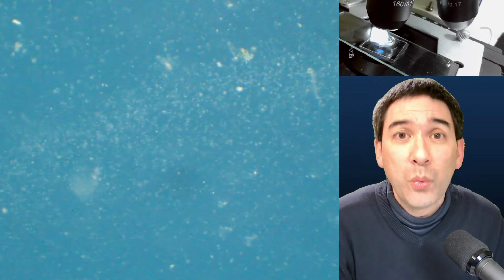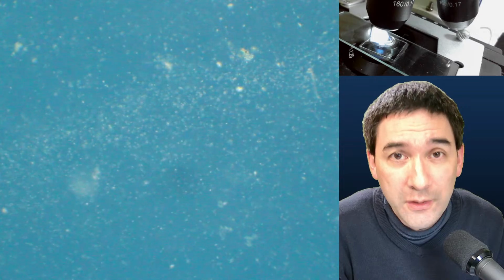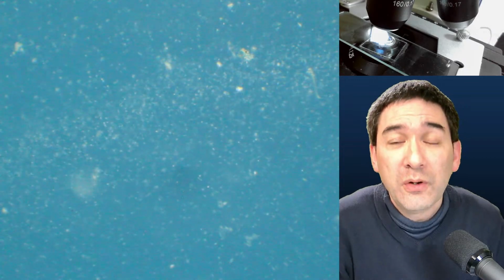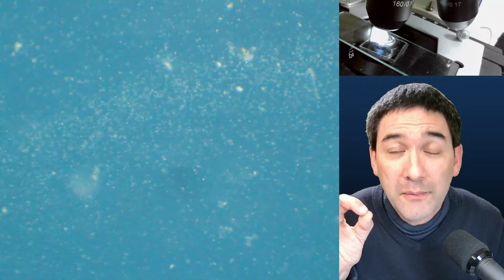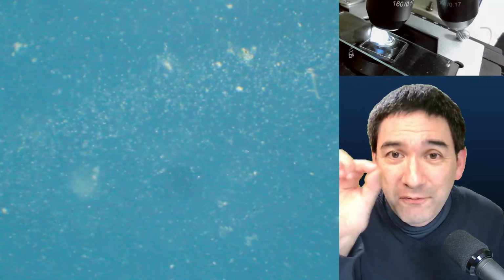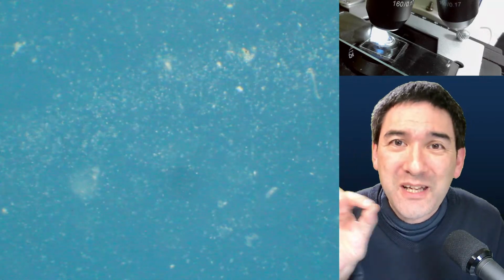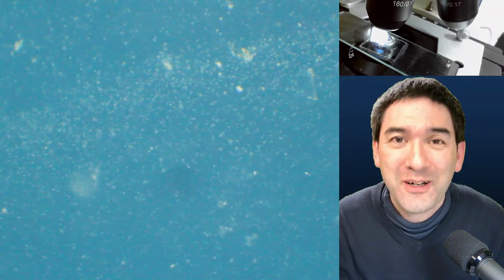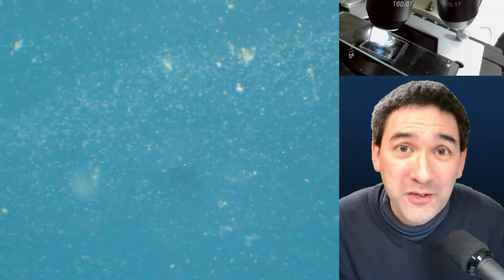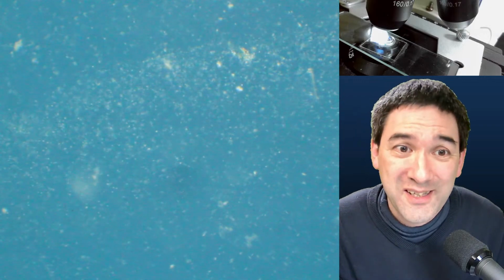Now, viruses are way below the resolution limit of the microscope. So you're still able to see particles that are that small. However, you're only able to see it as a fuzzy dot. So you're not able to see any structural details, of course, but you're just going to see that something is there. It could be a virus, but it can be any particle of that size, right?